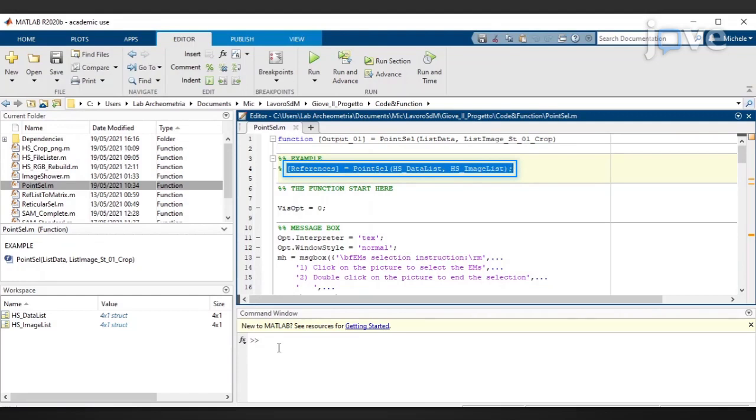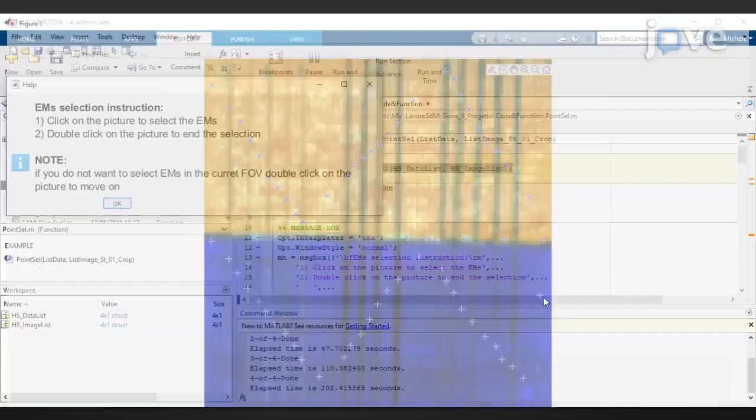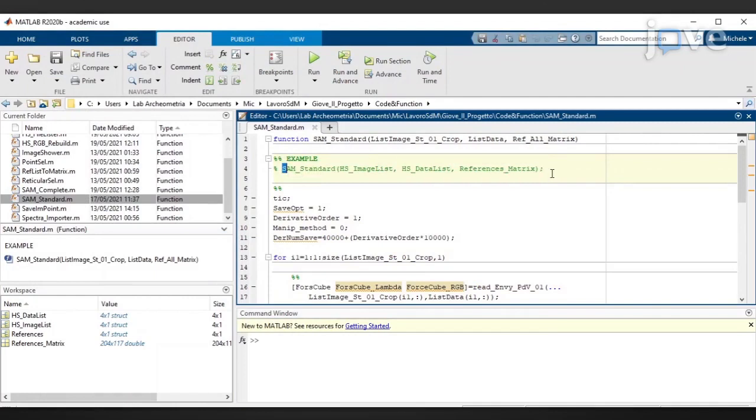Select the measurement points by clicking the interactive window that one by one shows the two-dimensional RGB images of the fields of view. Run SAMStandard, the standard SAMMAPS evaluation code.